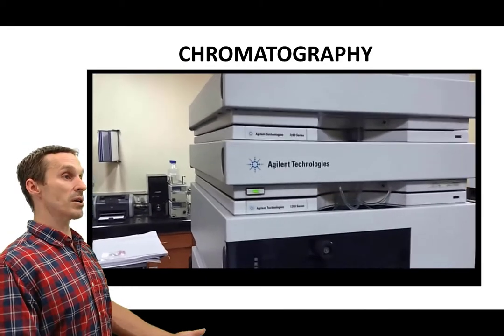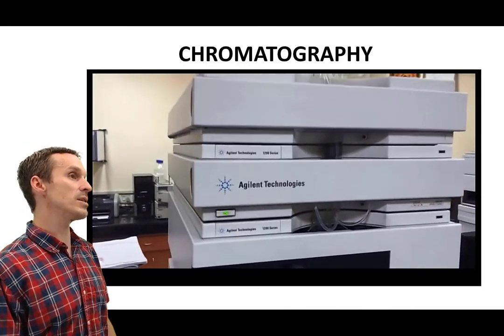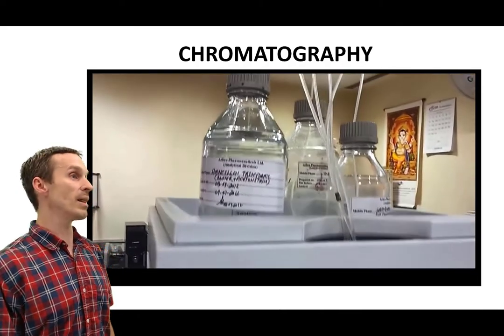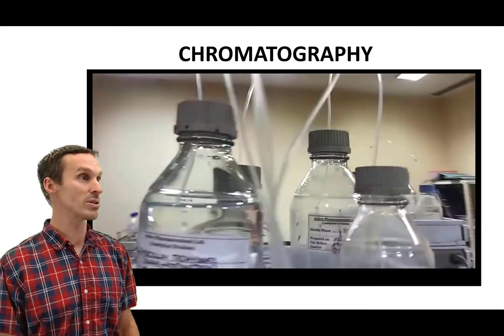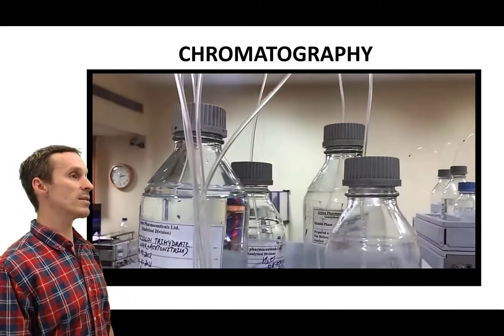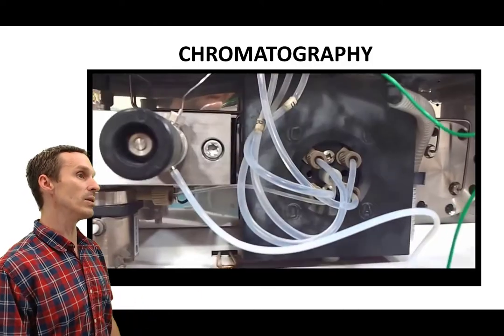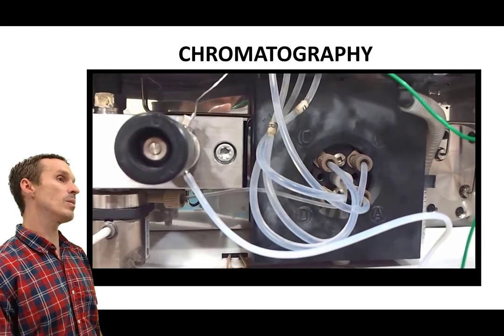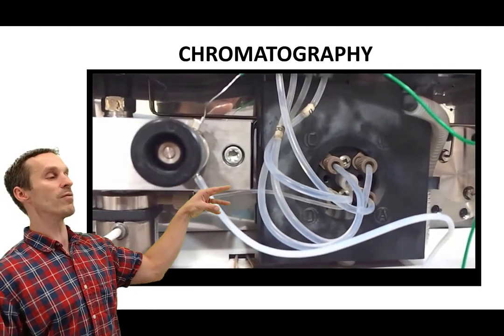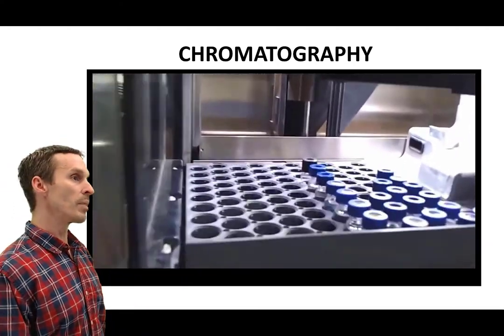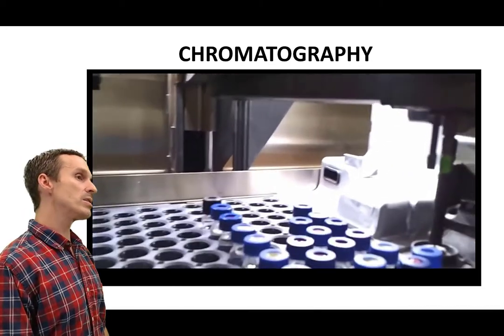What you're seeing over here is a commercial instrument, an Agilent HPLC system. I have one like this in my lab—this isn't my lab, but it looks just like this. We can see that we can mix and match different solvents to adjust the polarity and allow different molecules to elute. That's the pump system, and the tubing allows us to mix up to four different solvents and direct the flow accordingly.